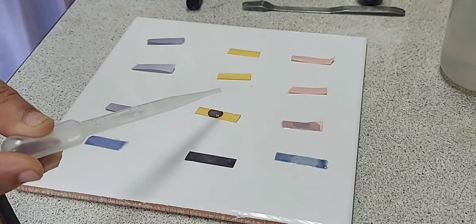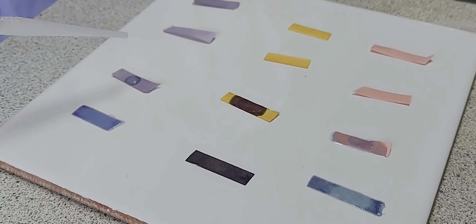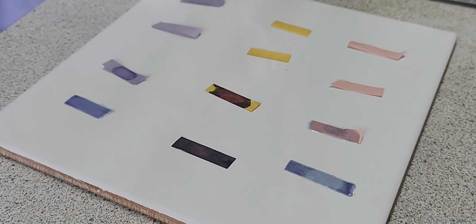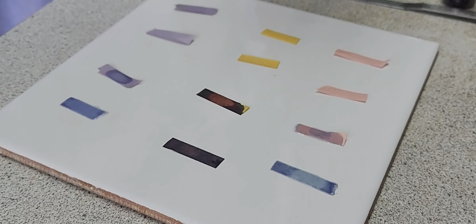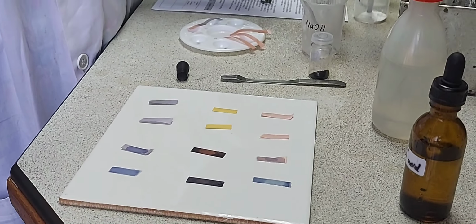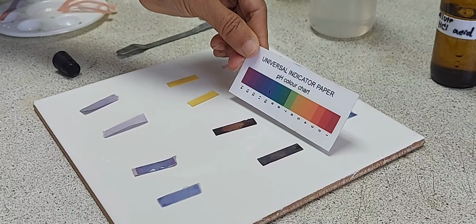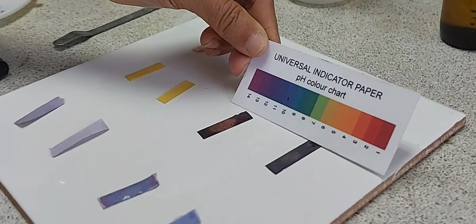The pH paper is turning purple, and of course the blue litmus will not give any significant color change. So you can compare the pH. For the pH paper, it is working out to be 13.